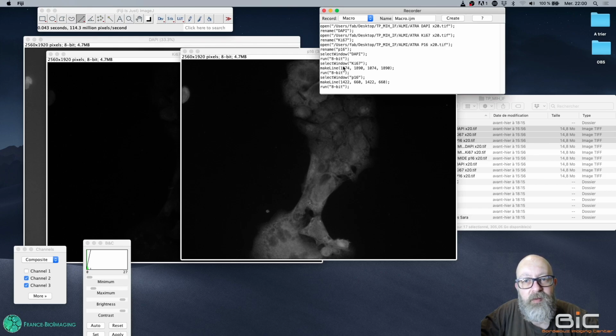Ooh, this is a mistake that it has been recording and that I can remove. Select and transform. I will remove this and make sure that my new tool that is selected is a rectangle. I will have less trouble with the rectangle.